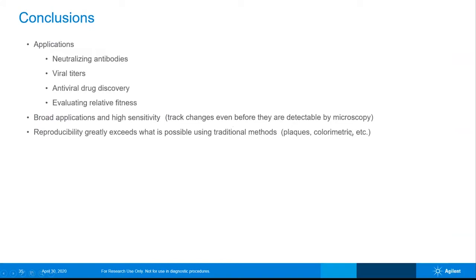In contrast, the legacy assay that had been used for that virus was an Alamar Blue assay. And there, the biological replicates varied 100-fold. So impedance was able to provide a very substantial improvement in the reproducibility of that assay.